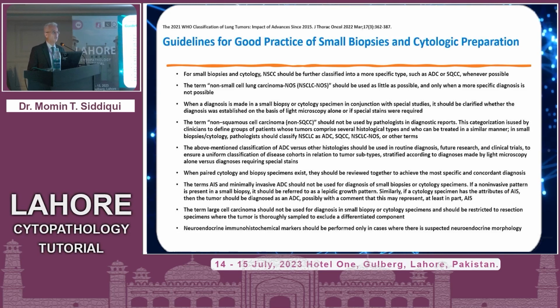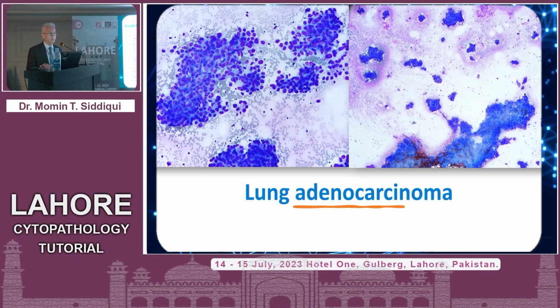So again, that's where collection comes into play. That's where a good cell block collection is important, because that's what you really need for not just characterization, but for confirmation of that characterization based on immunohistochemistry. So that is basically some of the summary outlines they have presented for good practice guidelines.